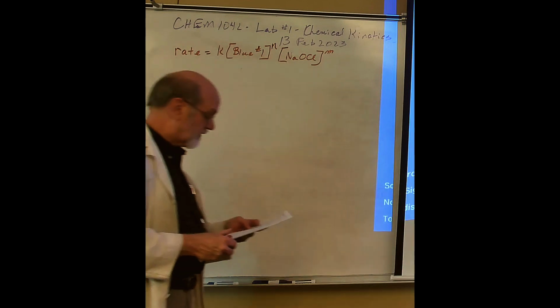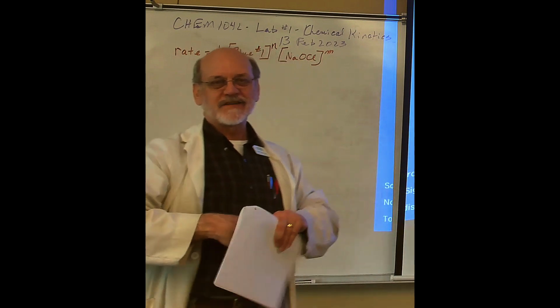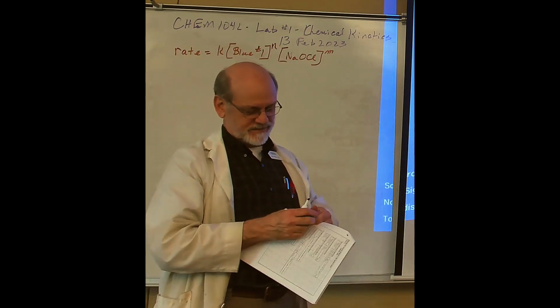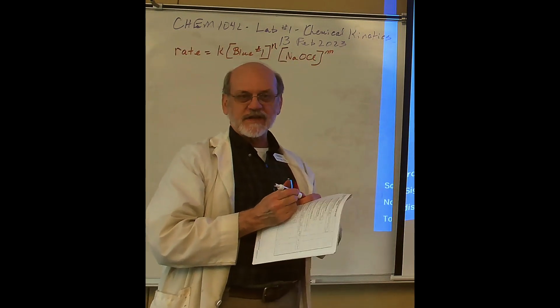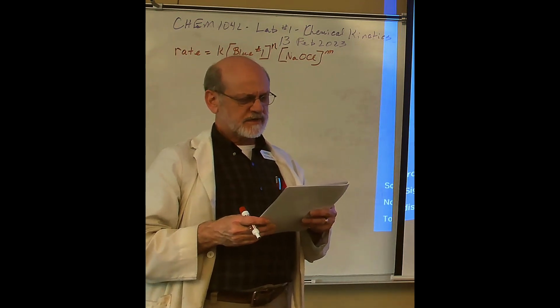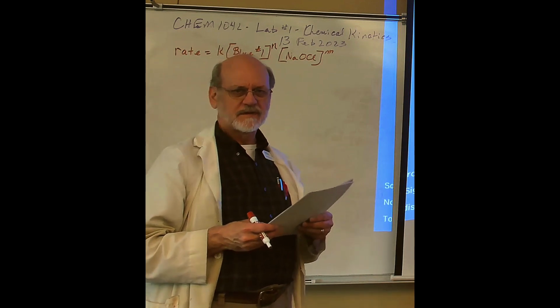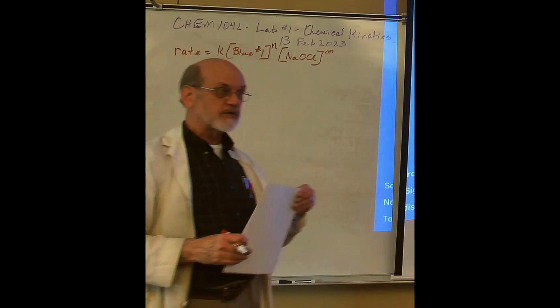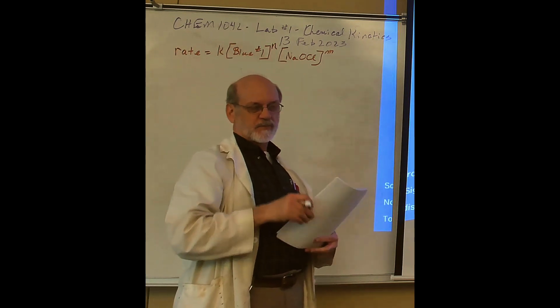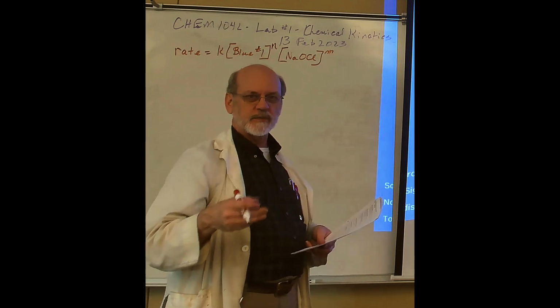Actually, I could save you some time if I just tell you how many drops to put in it, instead of going through the process of doing like they say, 2 drops at a time, increase, and then when you get within, what is it, bleach within how long? 3 minutes. 3 minutes. Well, that's kind of a fun part too. The procedure says, start off with this much and add 2 drops each until you get within 3 minutes.